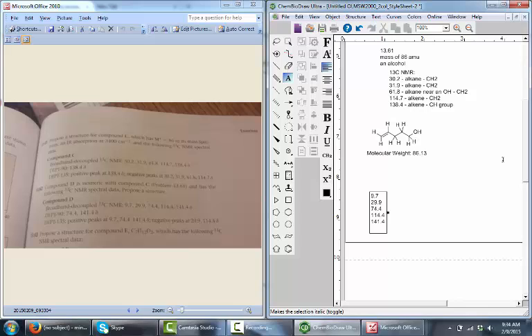Now let's figure it out. DEPT 90 gives me, again, the CH signals here, gives me peaks at 74.4. So that's a CH. And then 141 is also a CH. Now the DEPT 135 positive peaks, those are my CHs or CH3s.